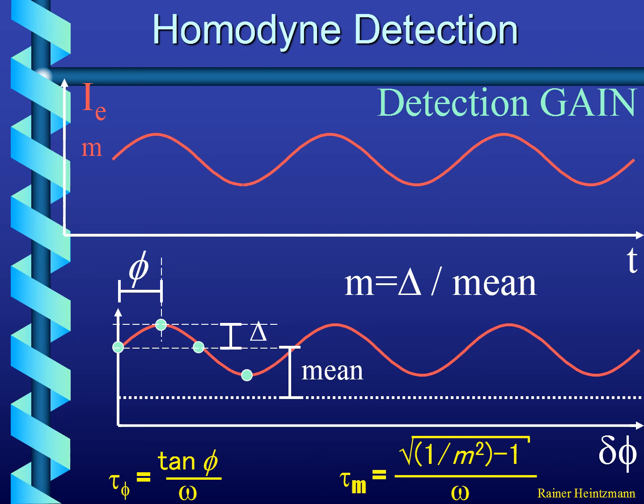This is what you typically do in a single frequency, frequency domain lifetime measurement. By comparing these two measures, if they are the same values, then we most probably have a mono-exponential decay, and we're kind of happy and we think we understand everything. If they are different, we don't know very much, except that it's not a mono-exponential decay.